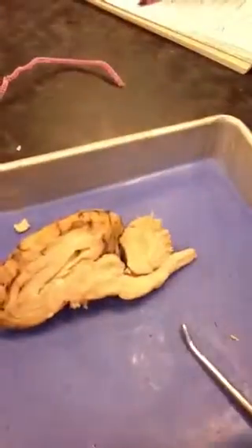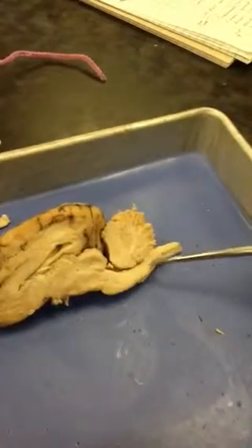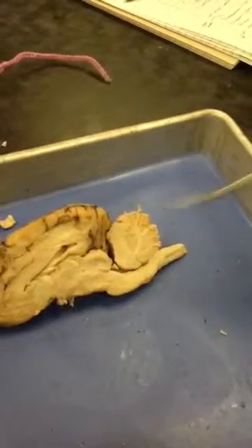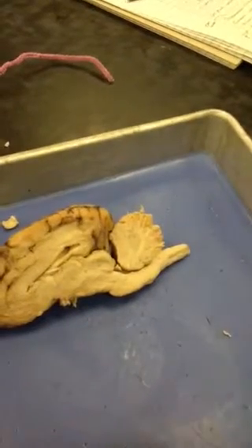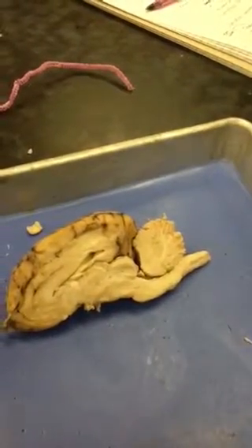Okay, so then next we have the pons. The pons area is right here, and then you have the medulla oblongata. These two structures make up the brainstem. They're in charge of primitive things such as breathing and heart regulation and stuff like that.